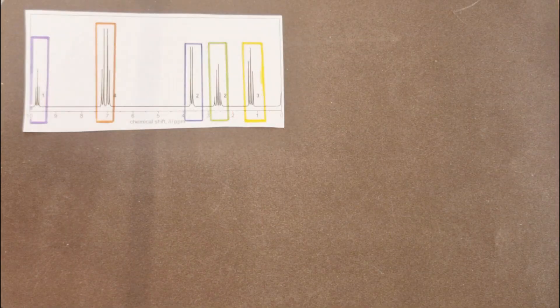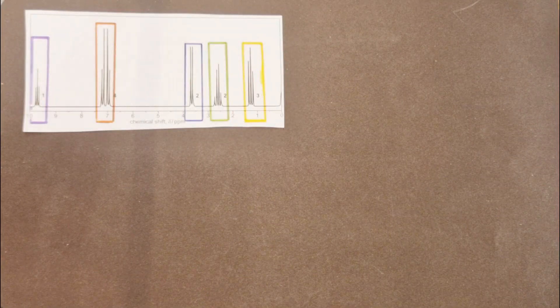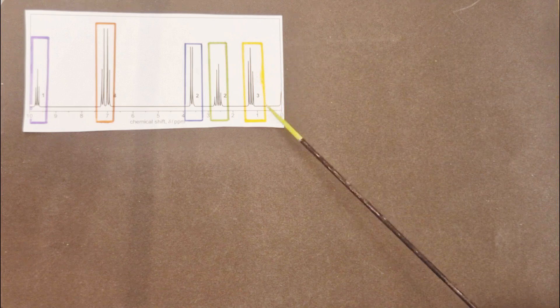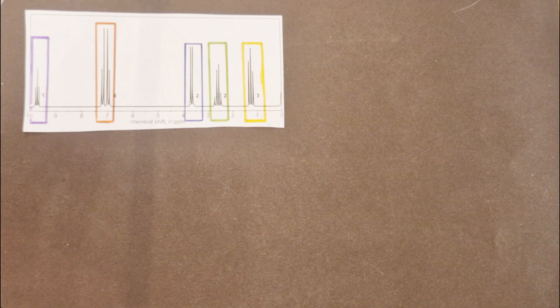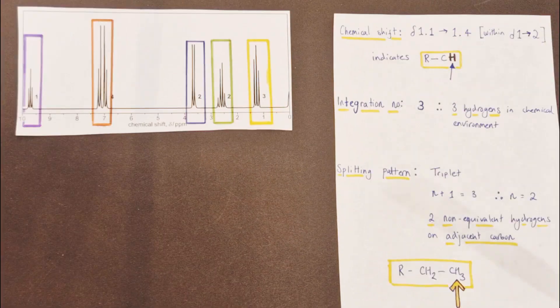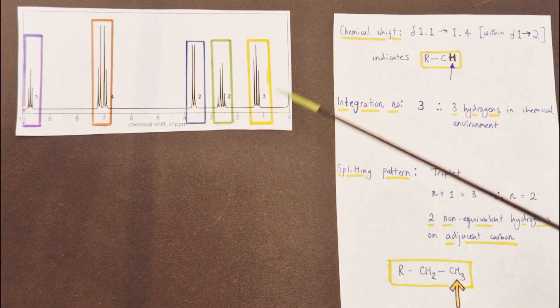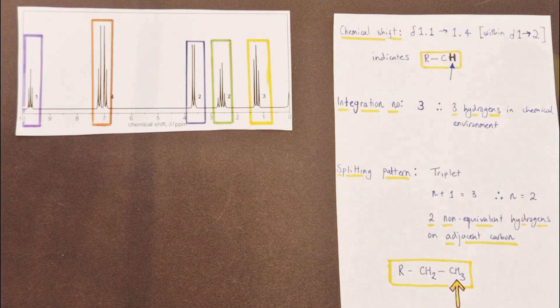Let's tackle this spectrum one data set at a time, starting with the triplet peak found around the 1.1 parts per million region. Here is a summary of all the information we can gather about this first triplet peak.